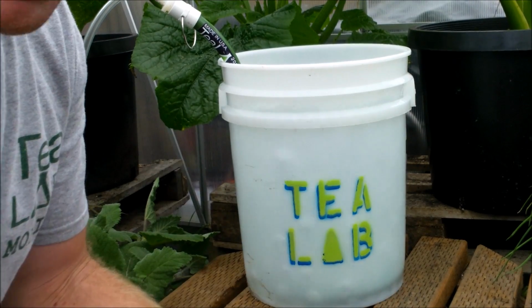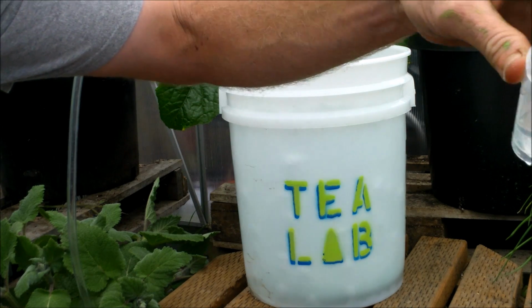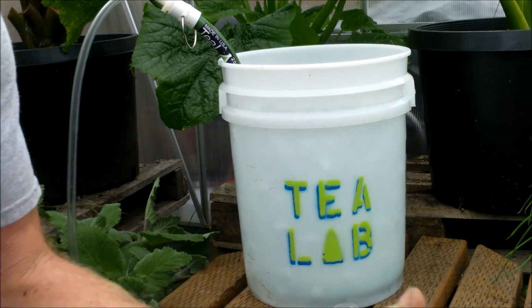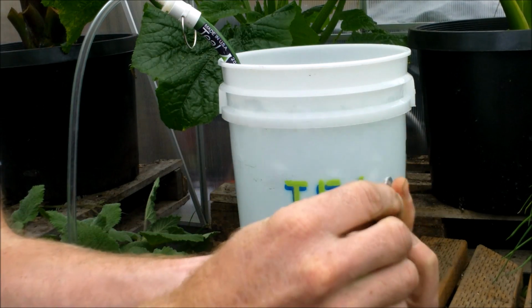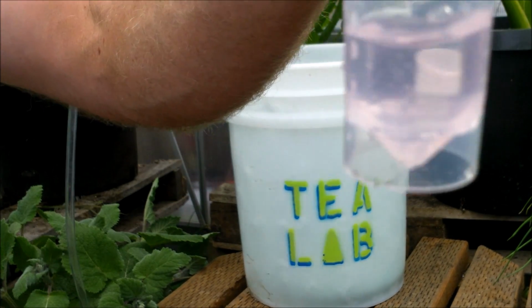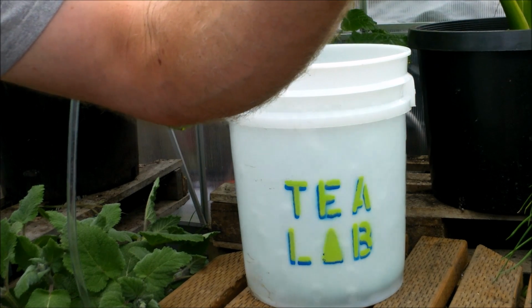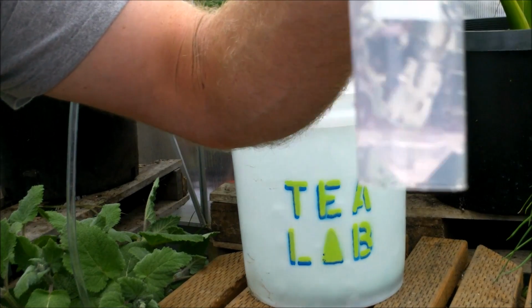What's up? It's Luke again. We're going to check it at hour 2 right now. It's 3:20. So the water's been bubbling for a full 2 hours, and we're going to see with our DPD packet whether or not there's still chlorine in there. Well, 2 hours of bubbling, which is the conventional wisdom: bubbling it for 2 or sitting it for 24. Well, that's not it. It's still pink, but it's less than the first time, that's for sure. So we're going to come back at another hour from now, 4:20, and see.